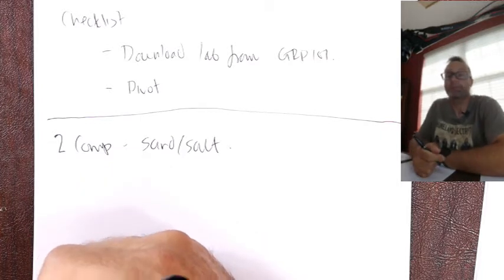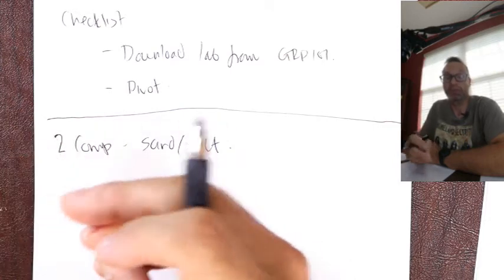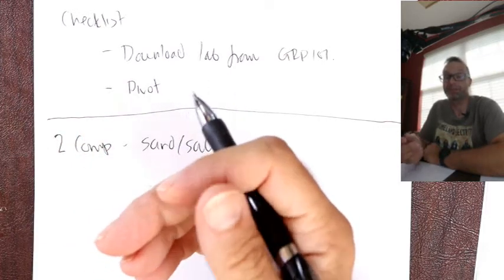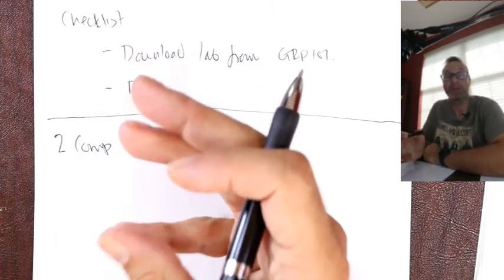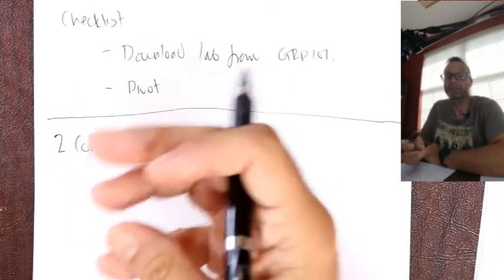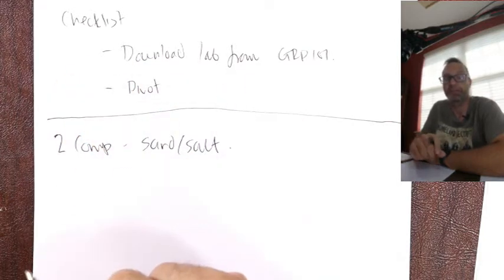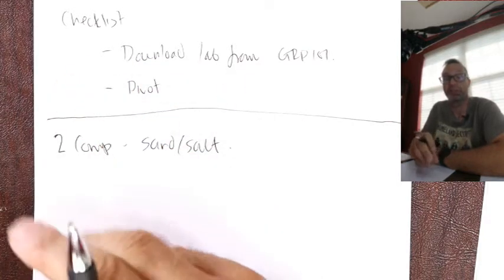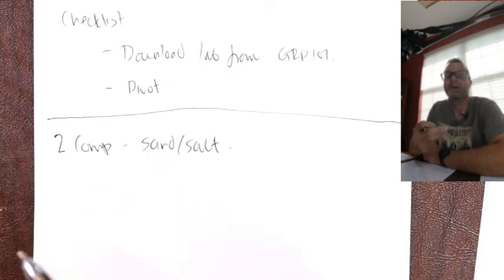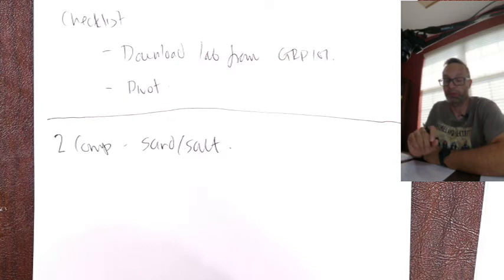Okay, so when we express answers for what a mixture is made of, we do it in percent composition by weight. So say I had 10 grams of a mixture, 5 grams of that 10 was sand and 5 grams of that mixture was salt. It's a 50-50 mixture, okay? So we do some little math later to show you how you turn grams of a component compared to grams of the mixture into a percent weight, okay? But before we do that, let's think about the experiment, okay?